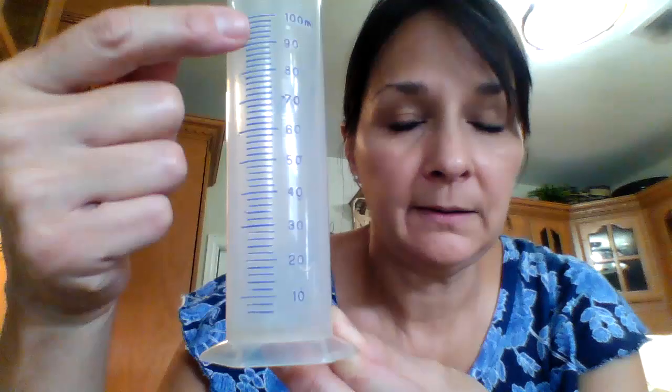So the way that we tell how these lines are counting is we look at the numbers, we notice they're going by tens, then we look at how many lines go from one 10 to the next, and we divide those two numbers. So 10 divided by 5 is 2. So these lines are counting by twos.